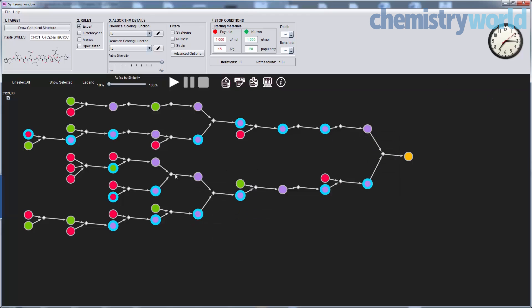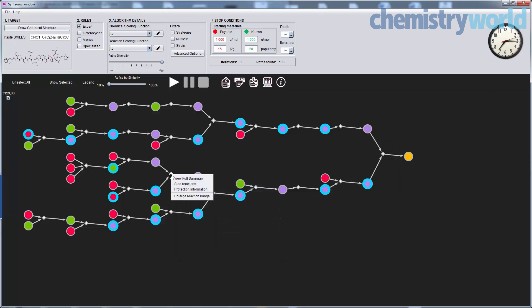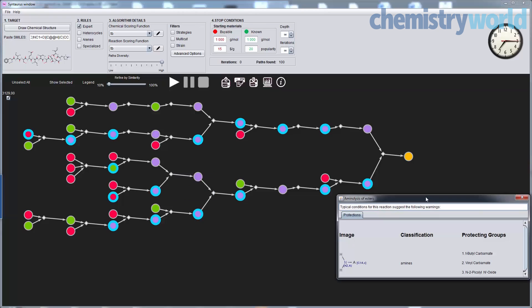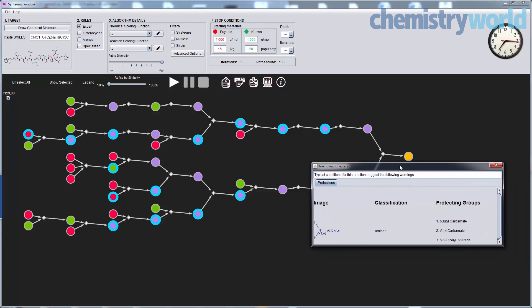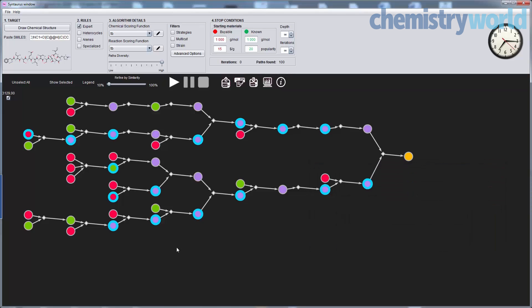Upon hovering over a reaction node like this one here, you get a full reaction summary. You can also see many blue halos on this plot. Blue halos denote a need for protection, and we just saw a need for protection for one.